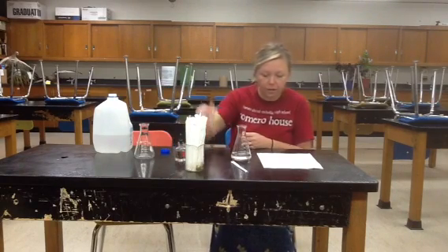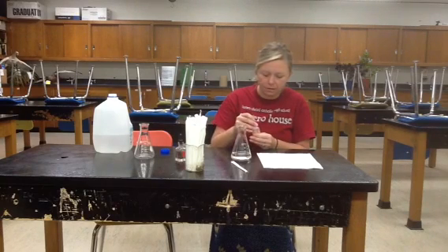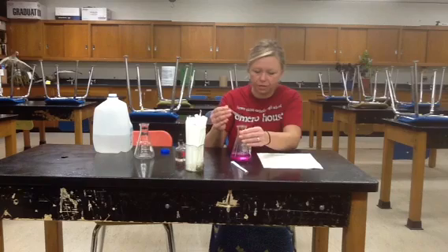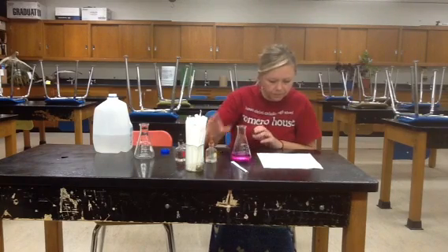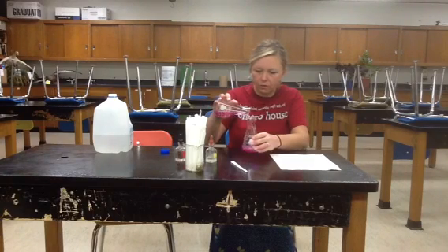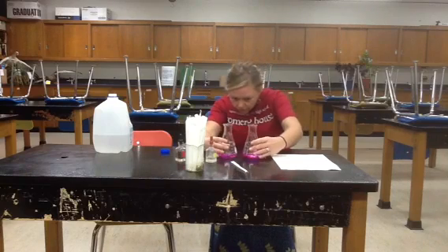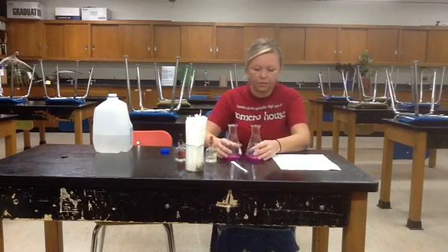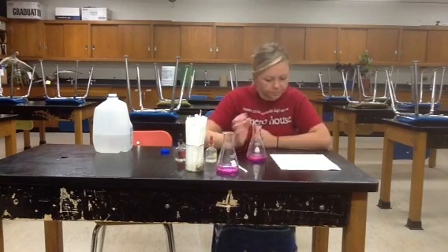So we're going to add the sodium hydroxide until it becomes light pink. And it just took 1 drop. Okay? Once you obtain that light pink color, you're going to pour half of it into a second flask. One of these flasks will be your control. Okay, so we'll call the one on the right our control. The other one is going to be your experimental.